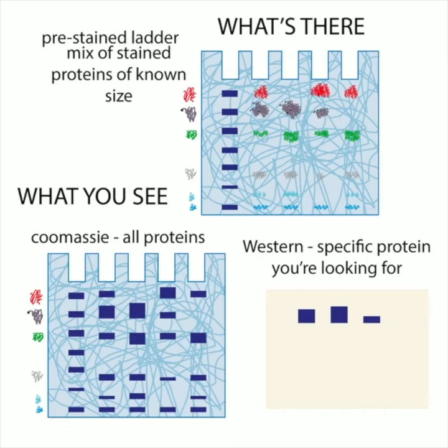Sometimes antibodies are not very good. So you'll want to have a positive control, a protein that you know should react to the antibody.